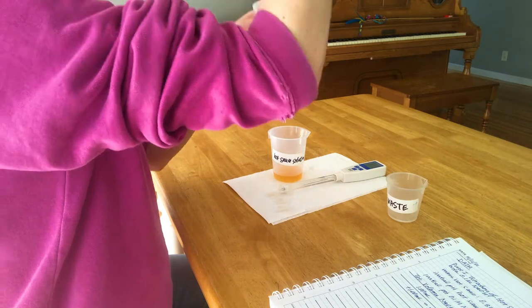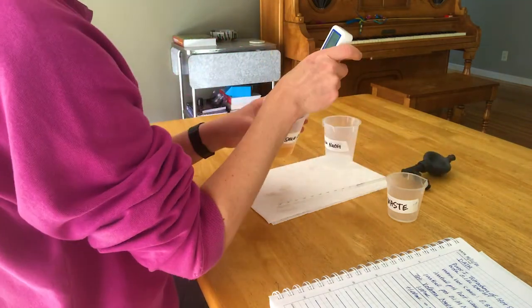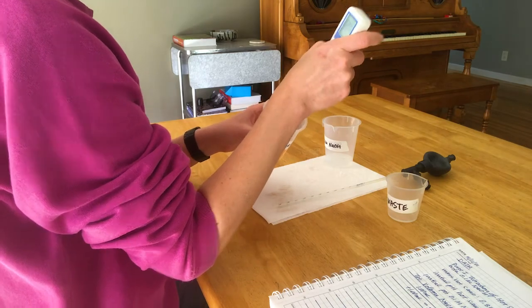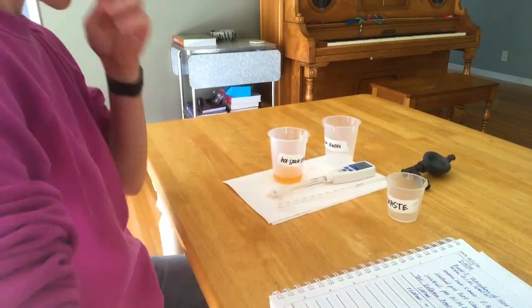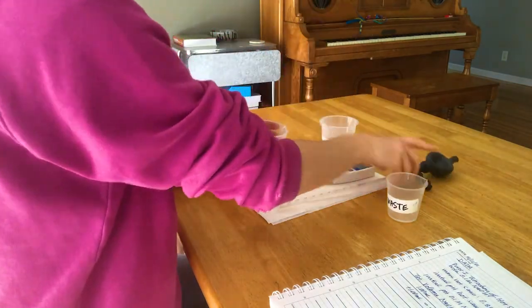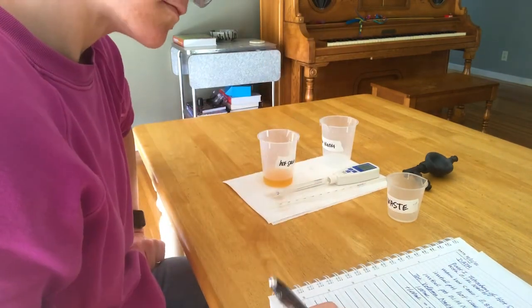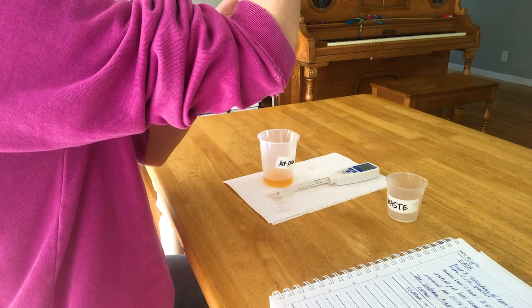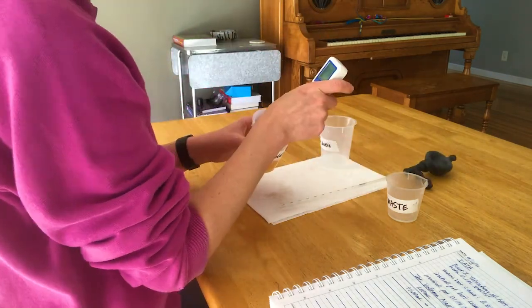Before cleaning up, you may want to go ahead and graph your curve to make sure that it looks alright, because if it doesn't, you have enough solution to do another one if you need to. To clean up, make sure that you rinse your pipette well with distilled water, and you can put all your solutions down the sink with lots of water. Rinse the pH meter off with distilled water as well, and place it back in its salt solution in the container that it came in.